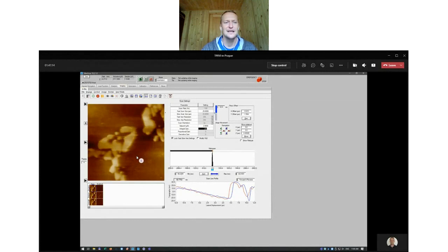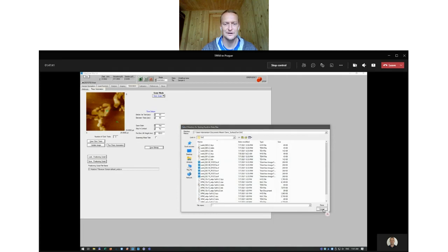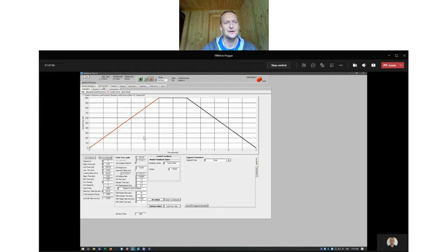If I go to automation and click script, I'm going to clear these previous tests, and then you basically click here, click there, and we can run a piezo automation, which means, let me actually cancel that for now. That means that we move the piezo to the specific position and make an indent.